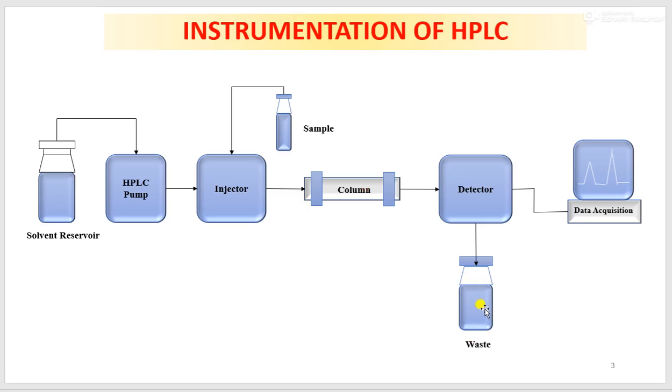So whatever is coming out or eluting from the column, after it reaches the detector, it will pass to the waste, and then last is data acquisition system. This is your computer.